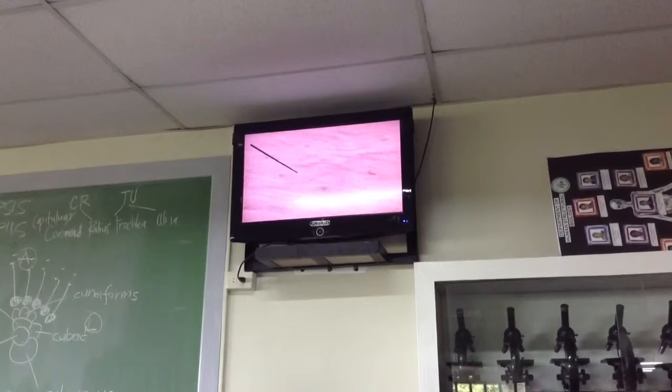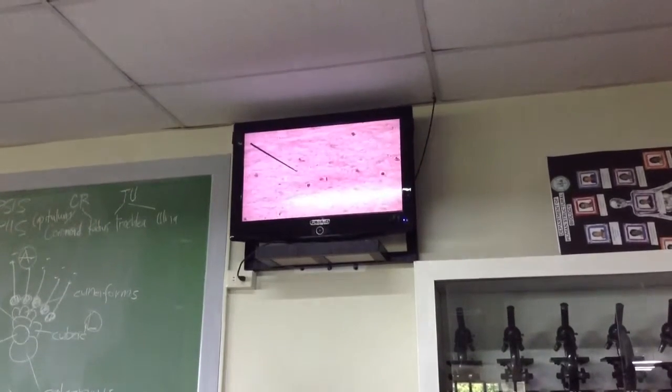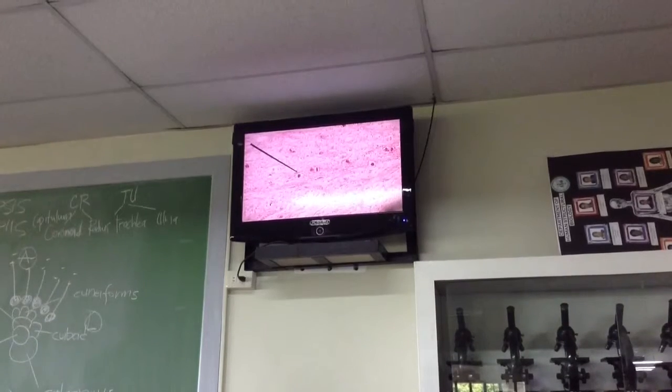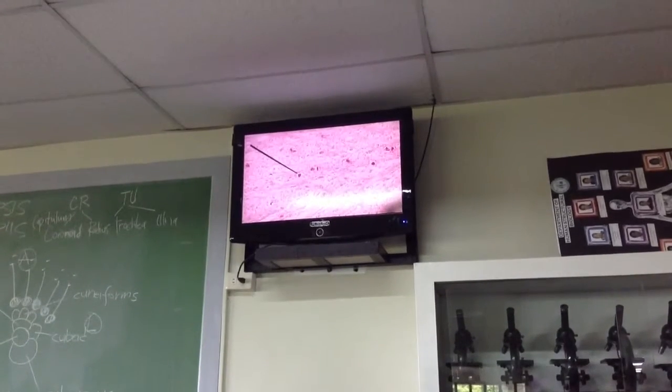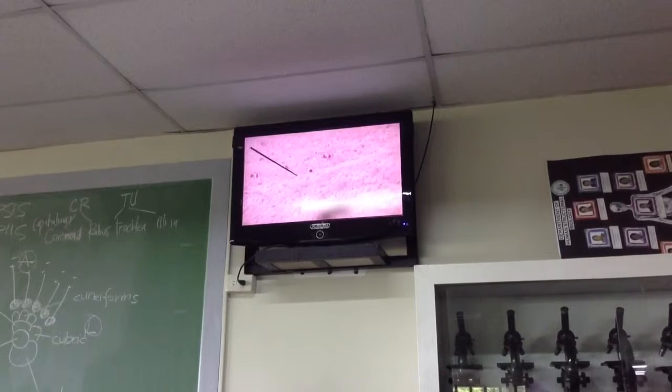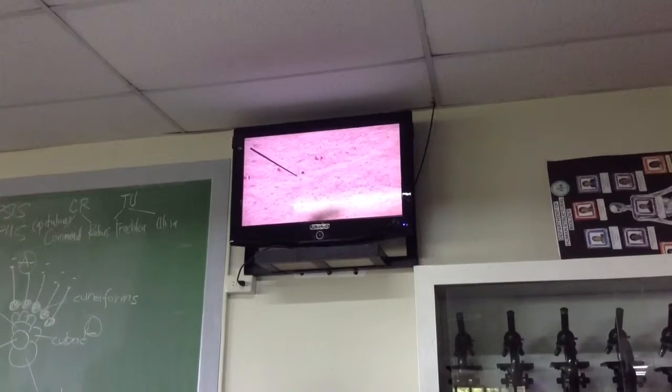Now, if you notice the chondrocytes, which are arranged in rows, but not apparent in this slide, they're surrounded by a clear area. That clear area is still a lacuna. So the chondrocytes are still lodged within a lacuna. Katulad yan, it appears to have a halo, so that is a lacuna.